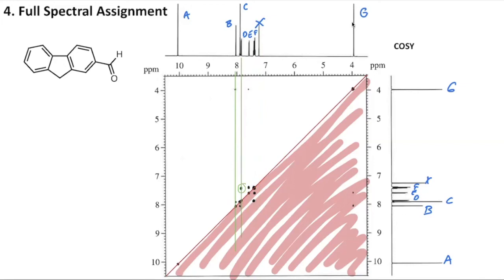But again, since that's in the red highlighted region, we don't need to identify that peak. It's already actually identified right here. So don't worry about that one. We're just going to worry about this one that is still currently circled. But I'm going to get rid of that circle so we can move on to another line down here. That looks like it's intersecting this small peak up here and also this off diagonal peak down here.